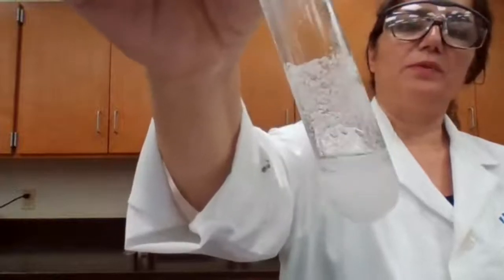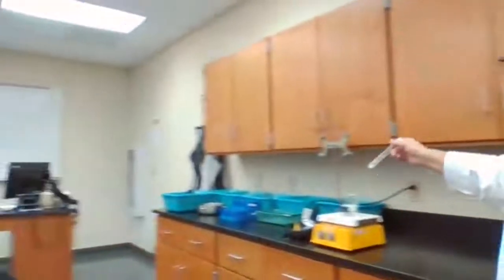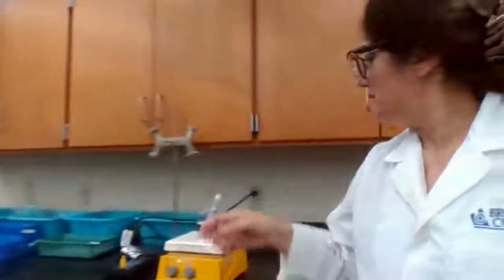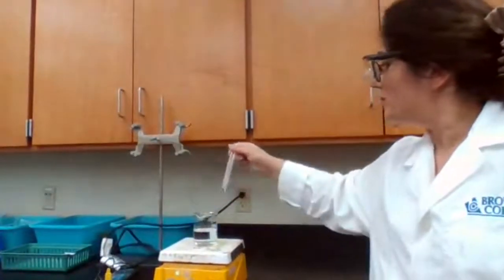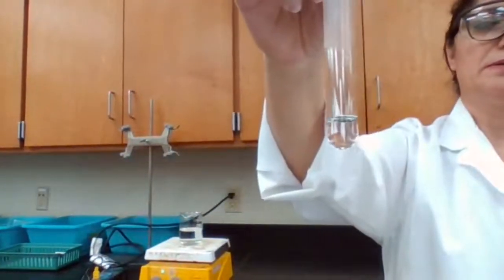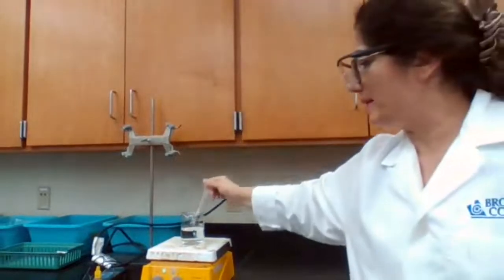We've got to finish part C. So we have ammonium chloride in the ice bath form solid crystals, and when we place it in the hot water, it changed to a clear solution. So in the hot water bath, it changed to a clear solution, and in the ice bath, you saw the precipitate.